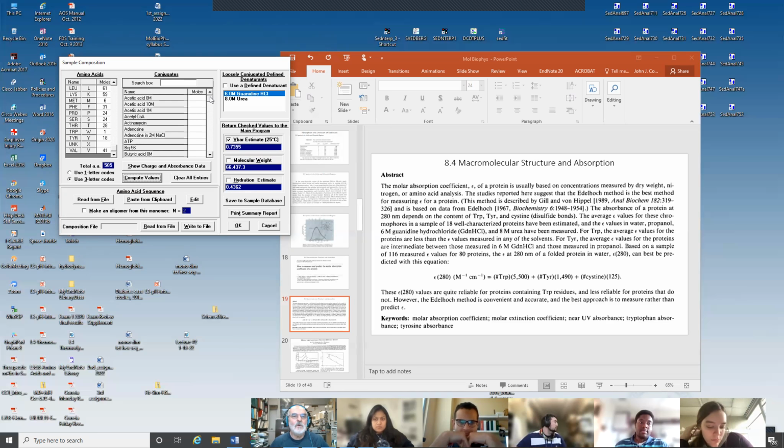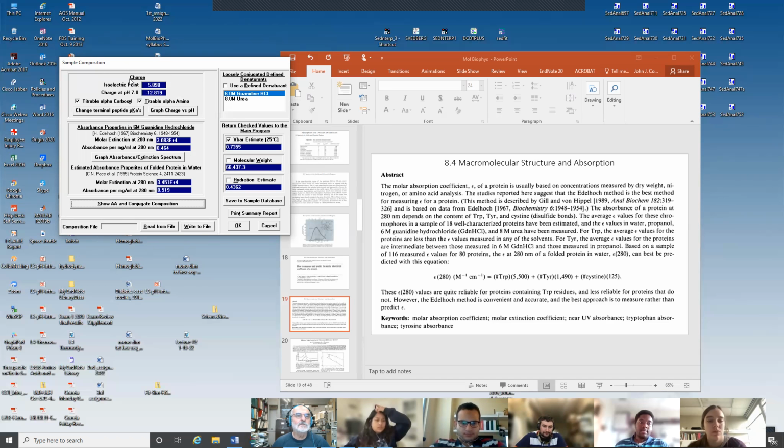If you had modifications on the protein, you could then add those and include them in the analysis. So for example, if you had sugar, lactose, or some other kind of sugar, or you knew you had guanidine involved, or there was glycerol binding or something else happening, you could include those as a cofactor. This software will also show you what the calculated charges are.